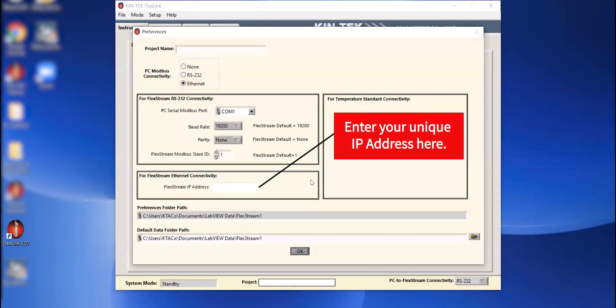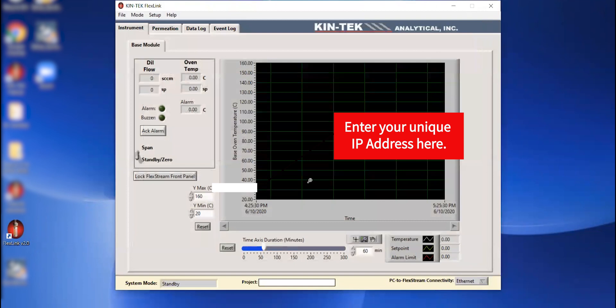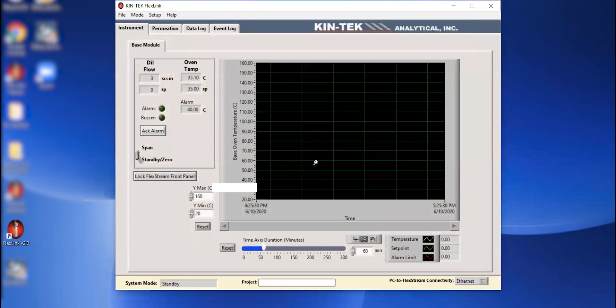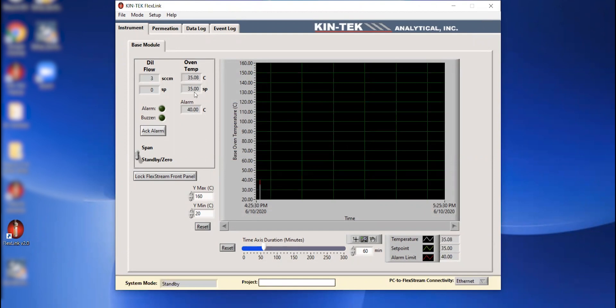Give the instrument a few seconds to connect. And it looks like we have a connection here. So we are communicating. We see that there's a set point on the oven temperature. So we're looking at the software. We came into the instrument tab when the software opens. And we can see that we're connected to a base module.